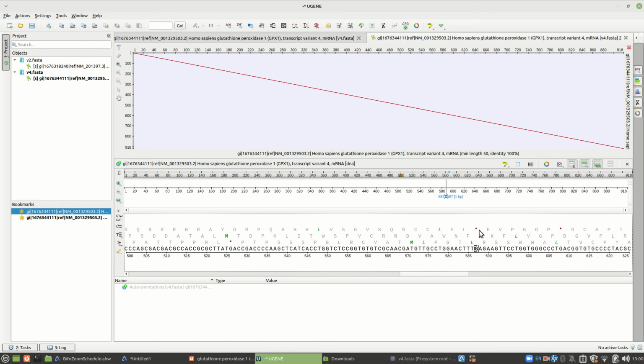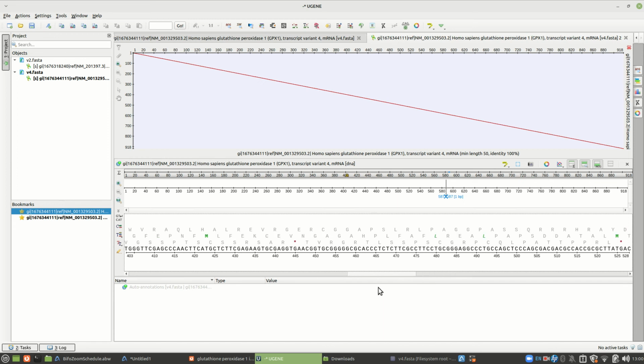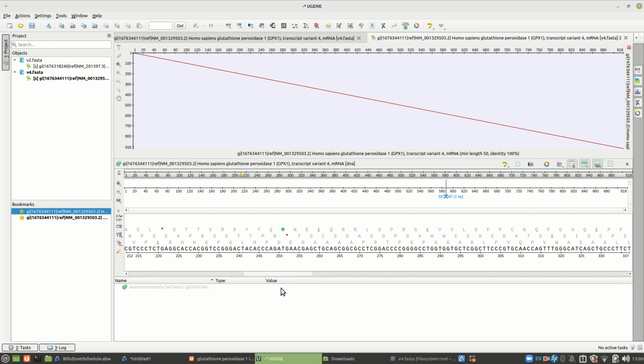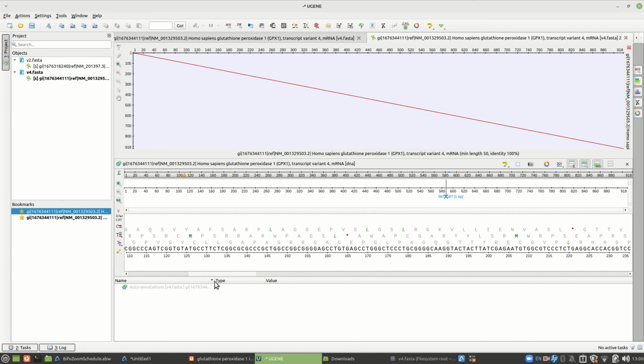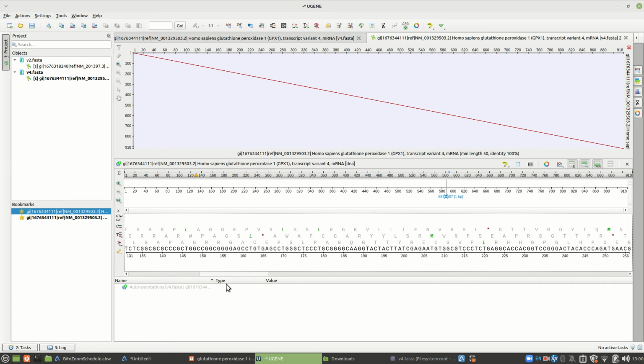So you can start here, but we go backwards, and you're going to notice that even though that's in the correct reading frame at the top, no, that is correct. There's a methionine at 250. And there's a methionine here at 75. But we get a stop codon here for some reason that doesn't get used at 220.